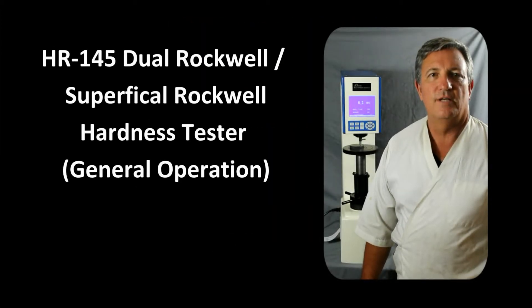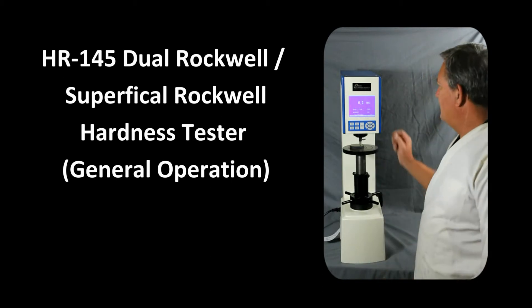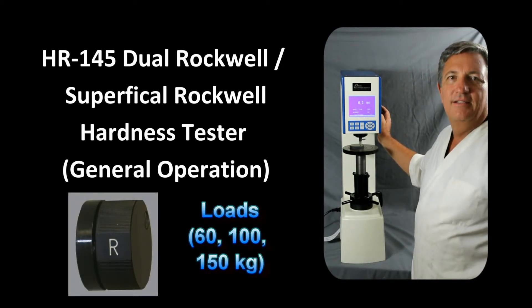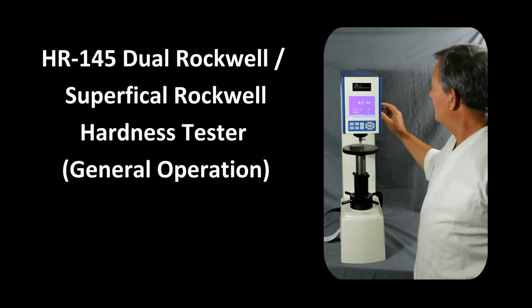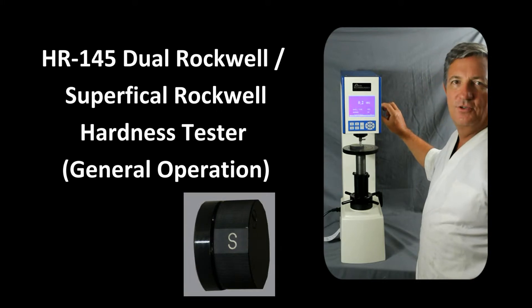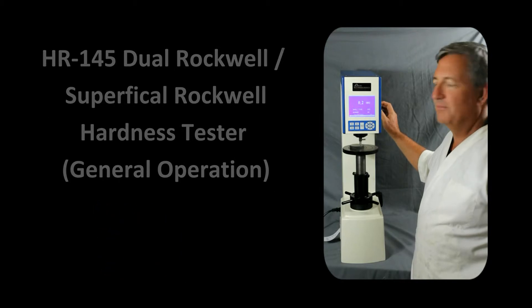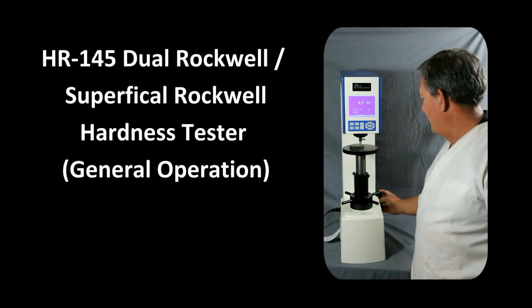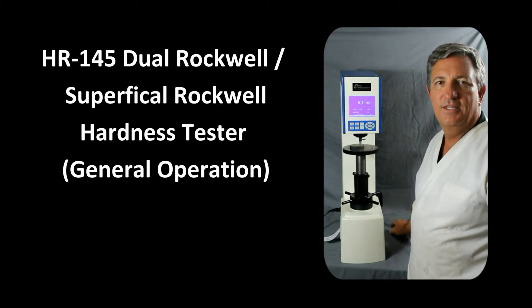The HR145 dual Rockwell/superficial Rockwell tester can be used in two different modes. One is the Rockwell load range, which includes 60, 100, and 150 kg loads. The superficial mode, selected by turning the knob to S, uses lower loads of 15, 30, and 45 kg. Right now we're set up in the Rockwell mode at 150 kg major load, which coincides with the C scale.